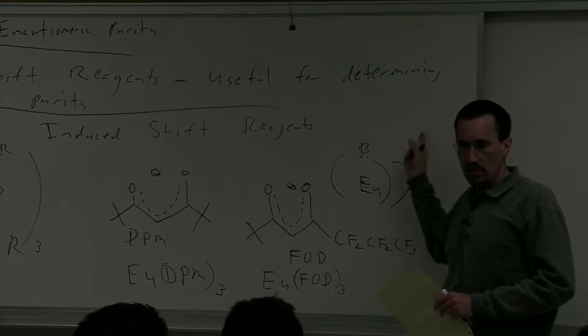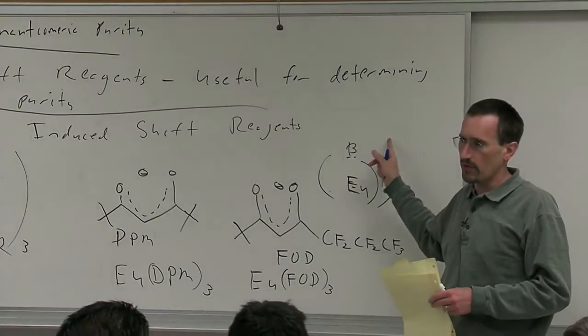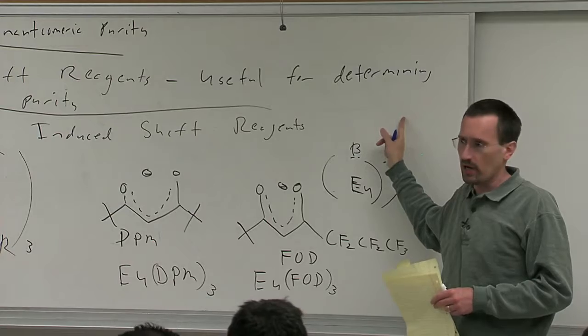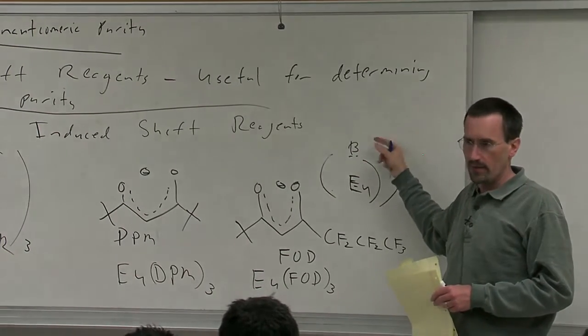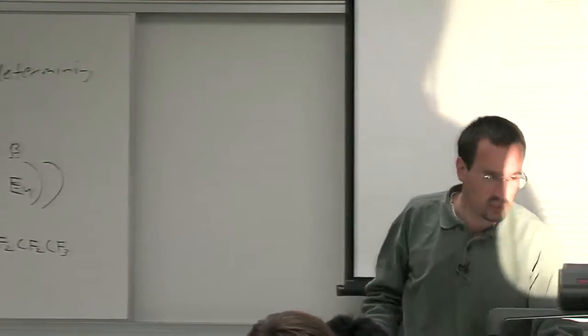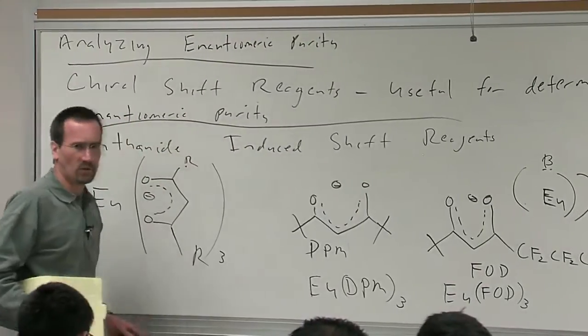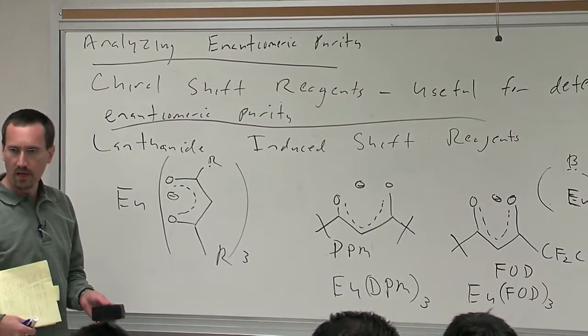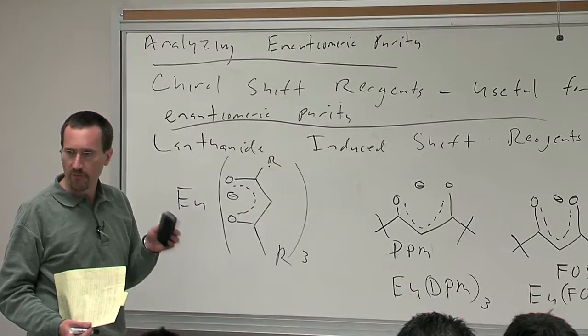So what's happening is there's both a distance and a geometrical relationship to the shift reagent that's resulting in shifting downfield from the paramagnetism. The further the protons are from the paramagnetic center, the less you end up with downfield shifting. There's also an angular relationship. All right, so that's sort of the background. As I said, I think they're actually a useful tool for solving overlap, but they've largely fallen out of fashion for that.